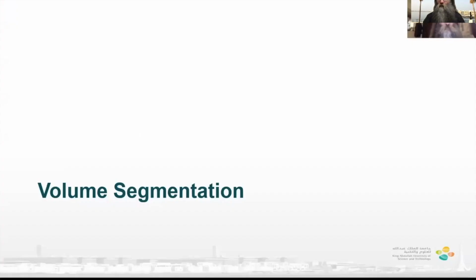All right, so welcome back, everyone, to the second session in this introduction to scientific visualization with Avizo workshop. We're going to look at volume segmentation now, and actually we're going to use the techniques we have learned in the previous session, to get a first idea, and then we'll try to identify the interesting structures in another data set. I'll just start the first video and share the screen. So let's do some volume segmentation.